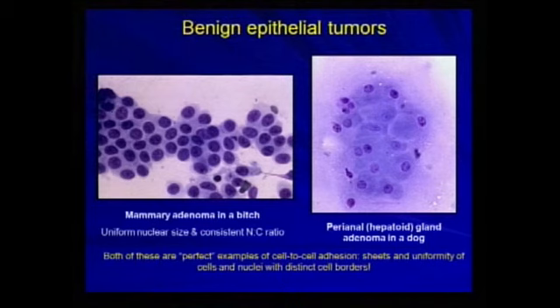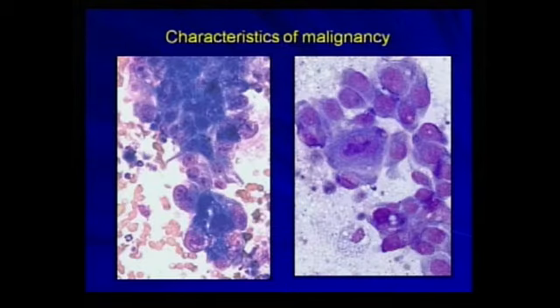In the center of this cluster, we see the large hepatoid cells. On the outside of the cluster, we see the reserve cells, just like we would see in tissue section. As we look in epithelial cells, or on the right, a mesenchymal cell, for evidence of malignancy, they start to become somewhat more apparent as you have more of a range of nuclear to cytoplasmic ratio, with the nuclei becoming larger.